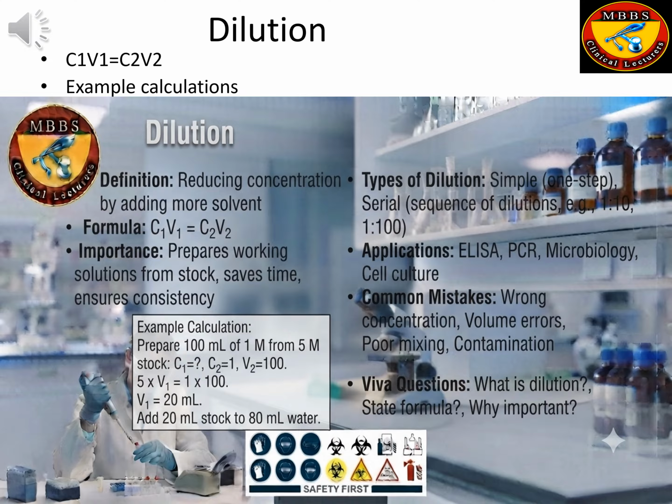Laboratory applications. ELISA. PCR reagent preparation. Microbiology cultures. Clinical biochemistry. Drug preparation. Cell culture. Common mistakes. Using the wrong stock concentration. Measuring incorrect volumes. Forgetting to mix thoroughly. Contaminating the stock solution. Incorrect calculations.